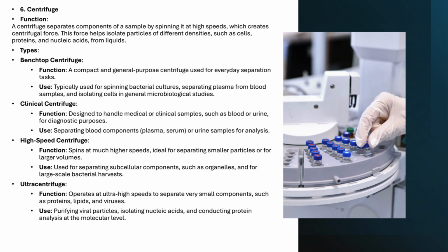From separating cells to isolating proteins and nucleic acids, the centrifuge plays a vital role in microbiology research and clinical diagnostics. There are several types of centrifuges, each suited for different separation tasks. Let's explore them. Benchtop centrifuge.